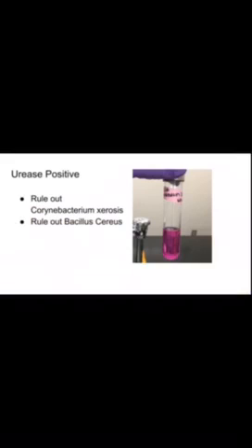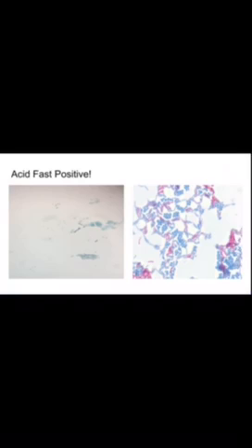After referring to my lab manual and our previous encounter with mycobacteria, I was reminded that this particular bacteria has a tendency to clump together and resist dye. So to be 100% sure, I would need to perform another acid-fast. I was concerned that my bacteria in my original broth culture were running out of room and nutrients, and I didn't want to take any chances with dead bacteria.